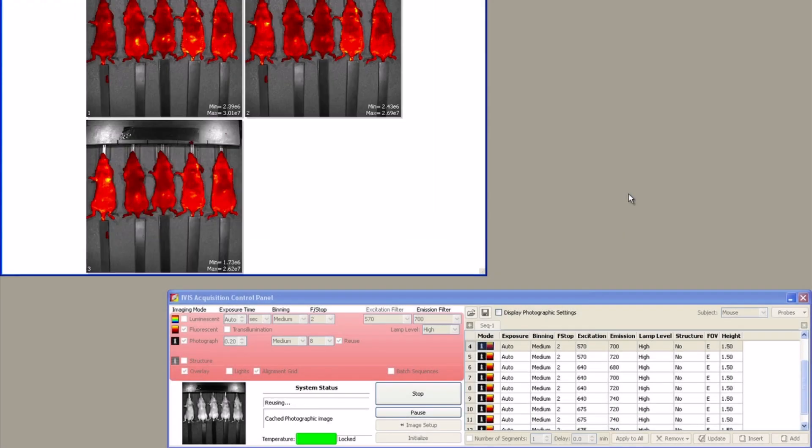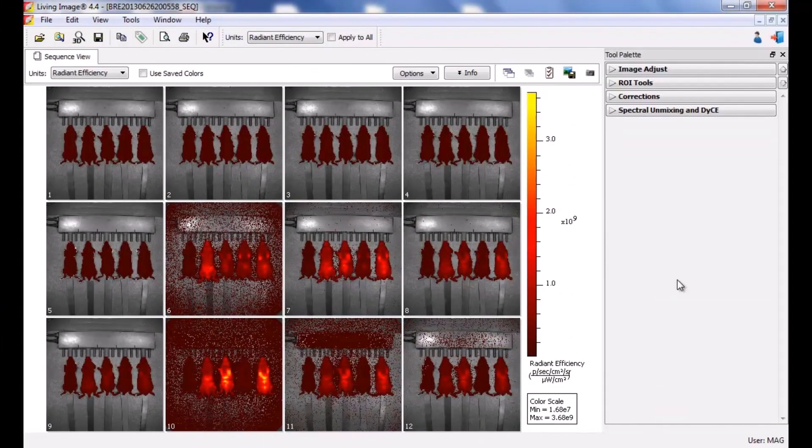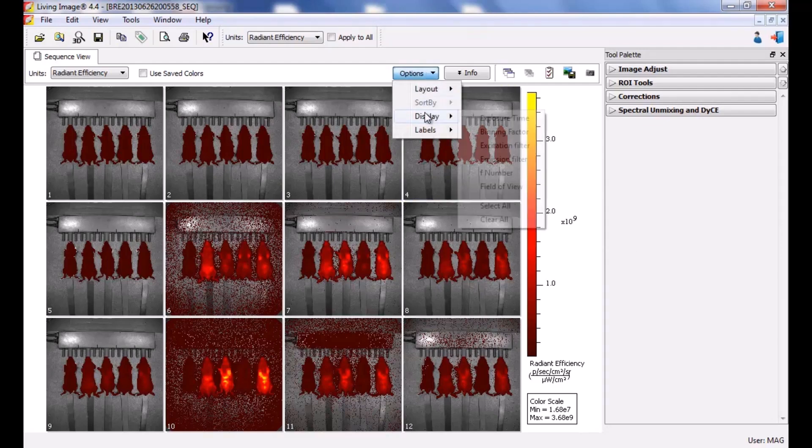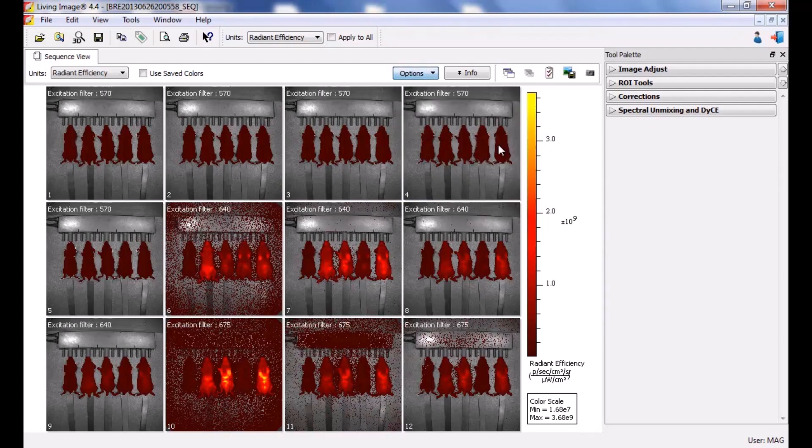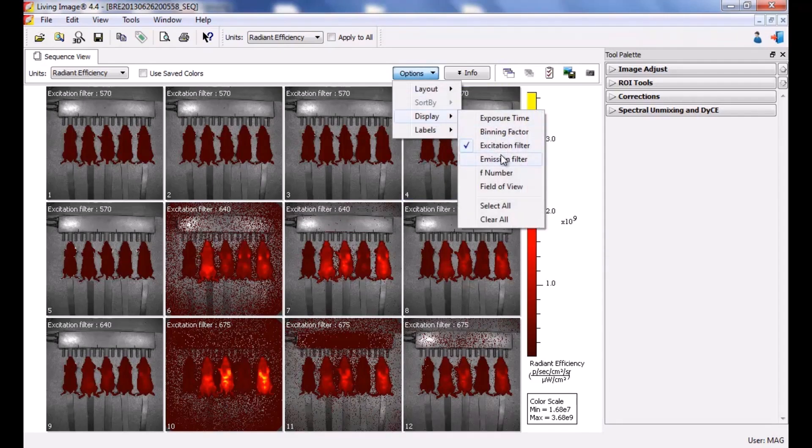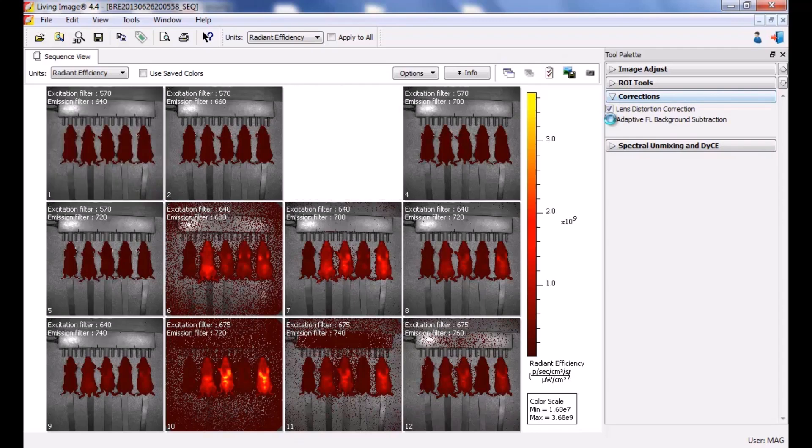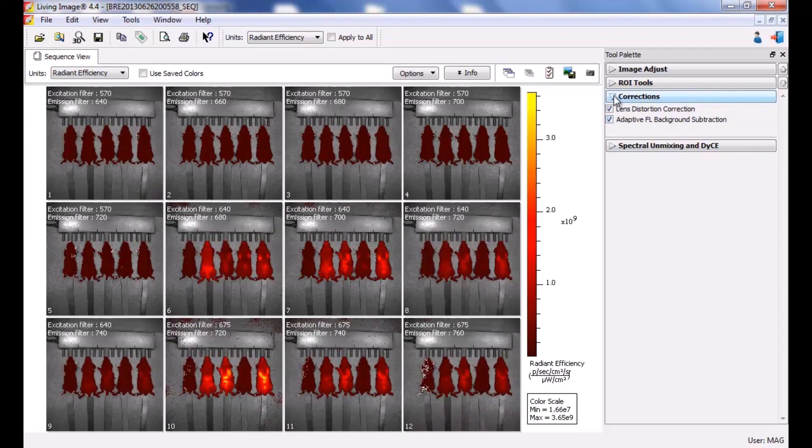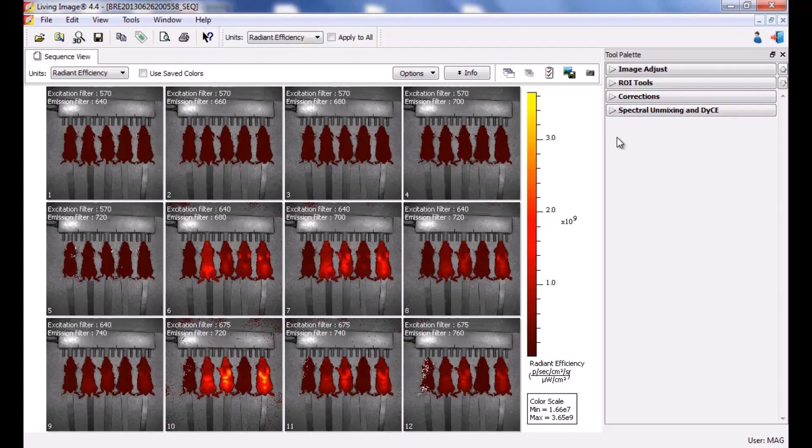The sequence editor will open and each filter pair selected will represent one image in the sequence. In this example, 12 images will be captured sequentially. Click acquire sequence and label your images appropriately. Once the instrument has finished acquisition, the status light will turn green. Remove the animals and return them to their cages. Using this acquired data set we will now generate our spectral libraries. To display the filters on top of the images, click the options button then select display excitation and emission filters.